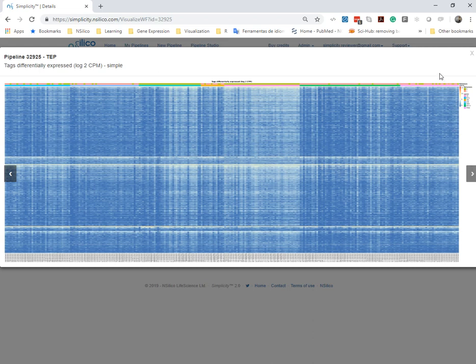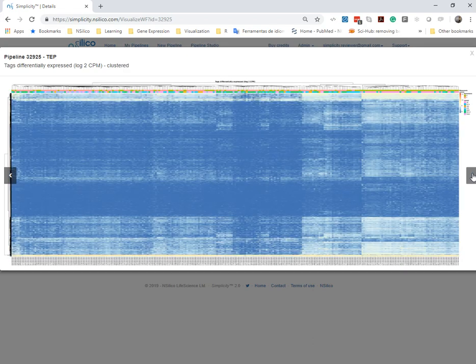This one I like because I take together all the genes differently expressed and plot them together. And these colorful lines here, they're showing the samples with metastases and different types of cancer. So on this side here, we have mostly healthy donors. Anyway, if you download, you will be able to see in more detail.